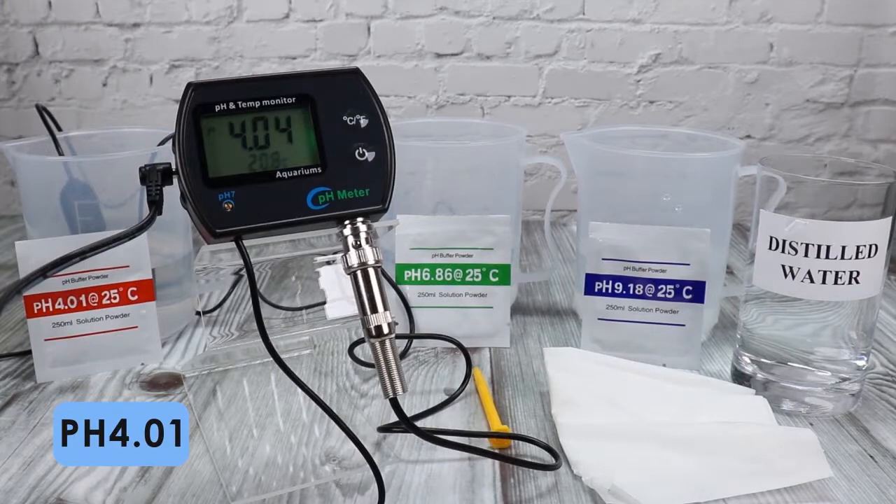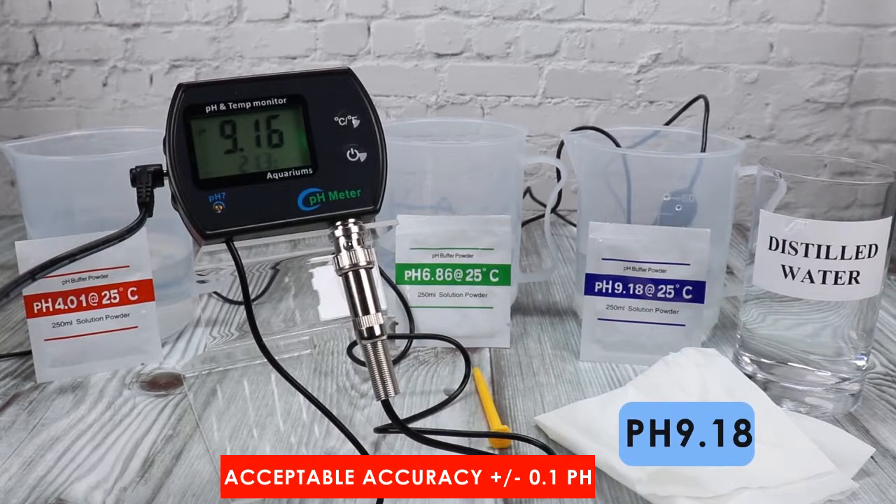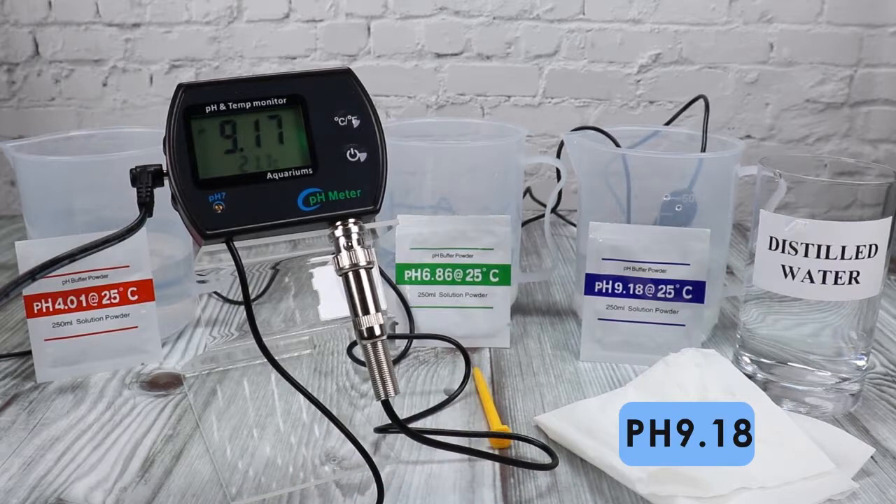Remember to rinse off between tests. Place again the electrodes in the 4.01 solution. It is acceptable if the display value is within the error range. And lastly, in the 9.18 solution. PHM245 is now completely calibrated.